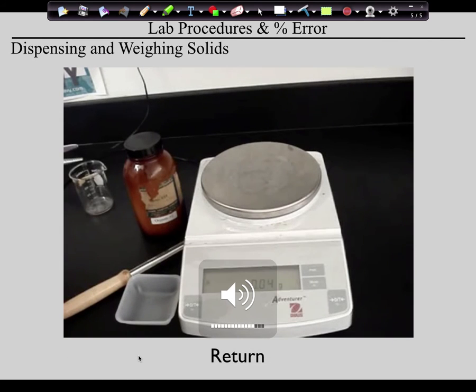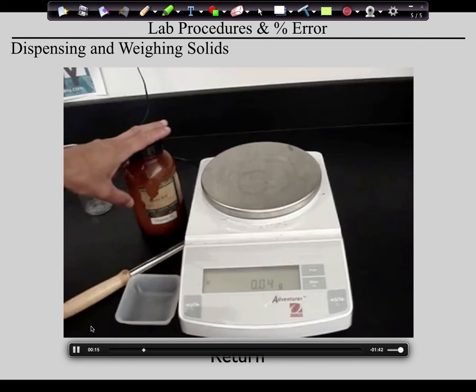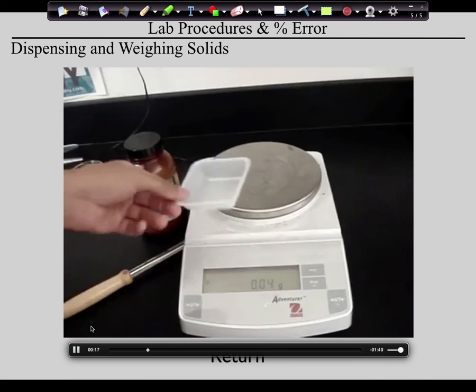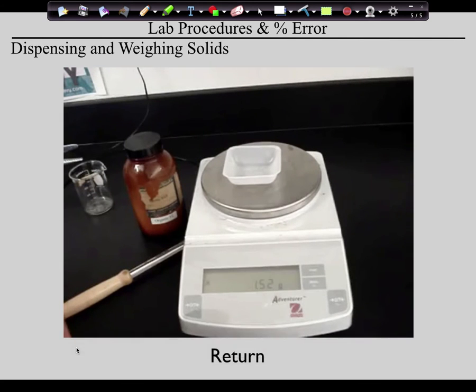When you're trying to measure out a desired mass of a chemical, it's important that you don't put too much of the chemical. Let's say I was measuring 2 grams of sugar. Well, I would first use a beaker or a weighing dish, put that on. Now I don't want the mass of that. So what do I do? Hit the tare button.